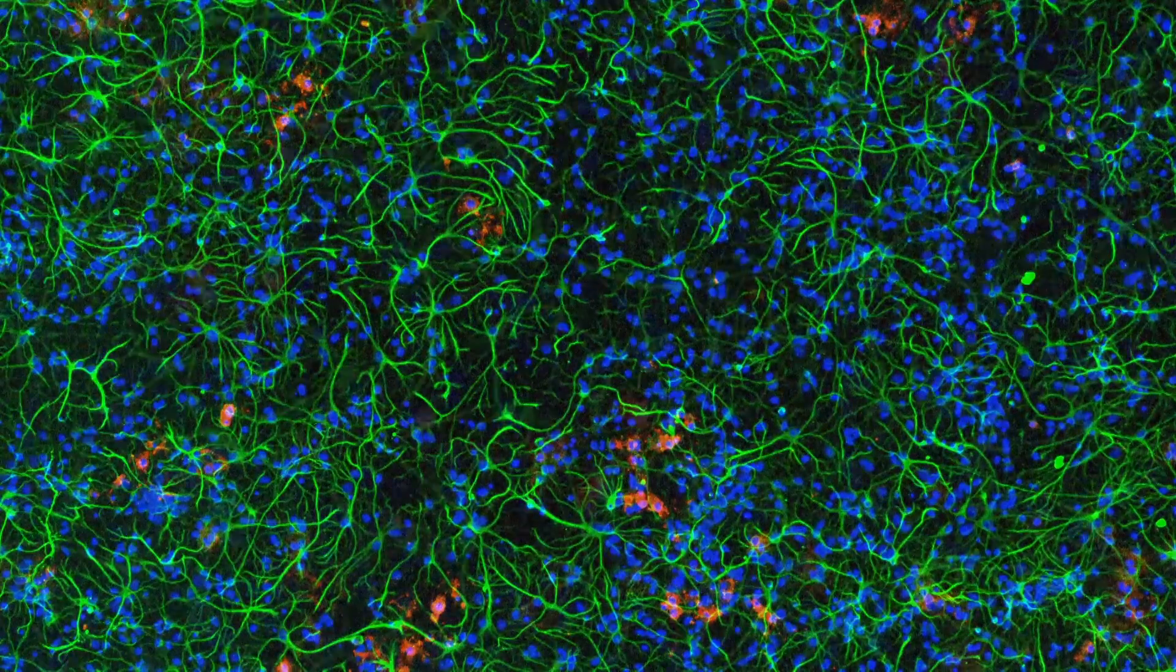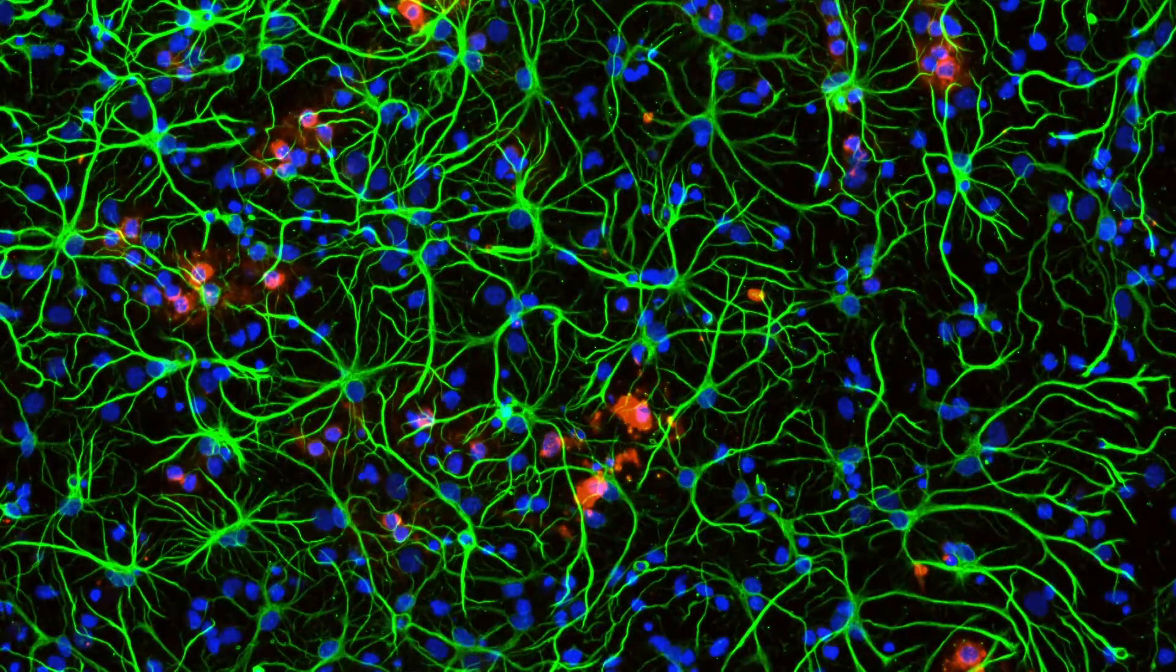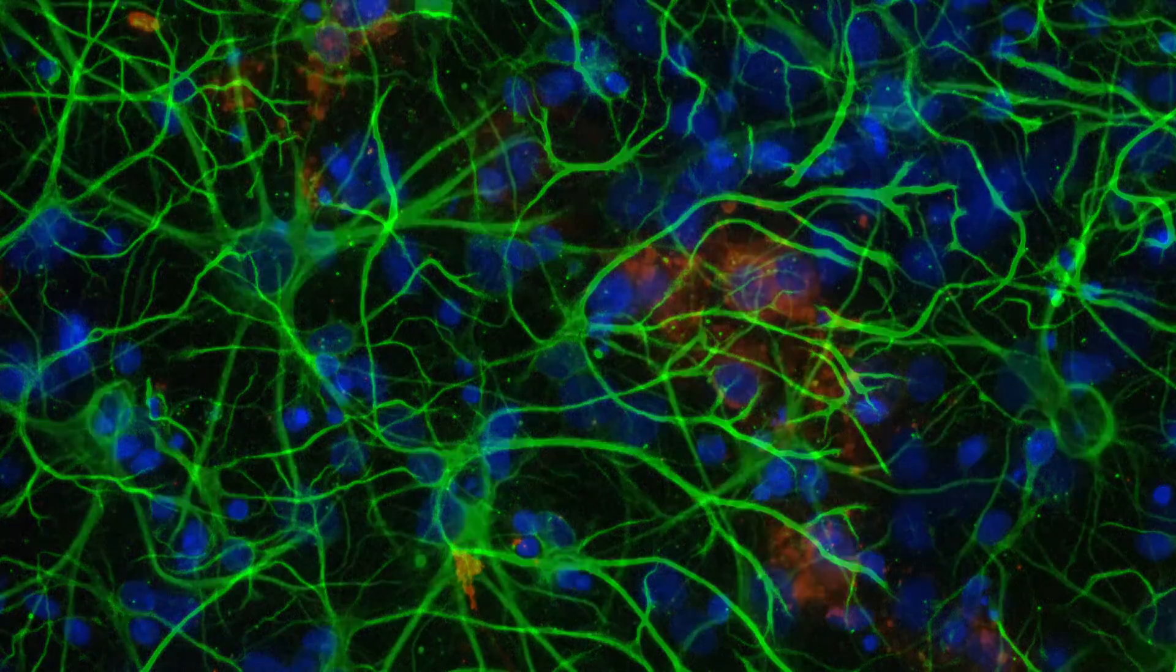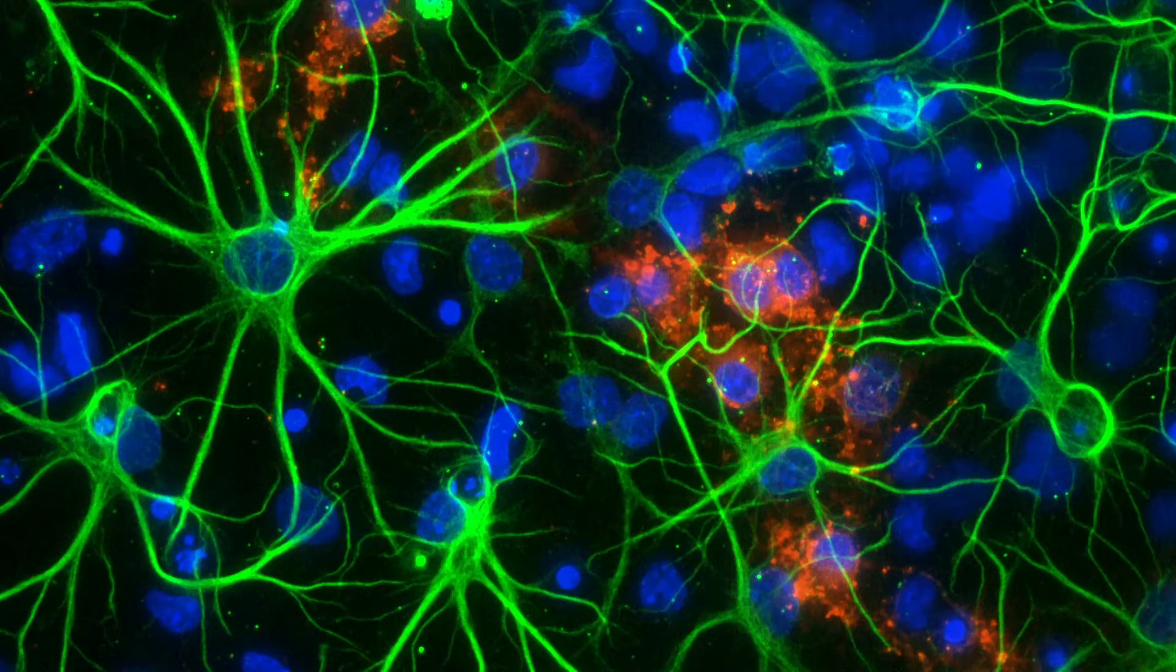An automated confocal and wide field imager, the ImageExpress Micro-Confocal System supports a variety of round or flat bottom plate types of up to 1536 well format.